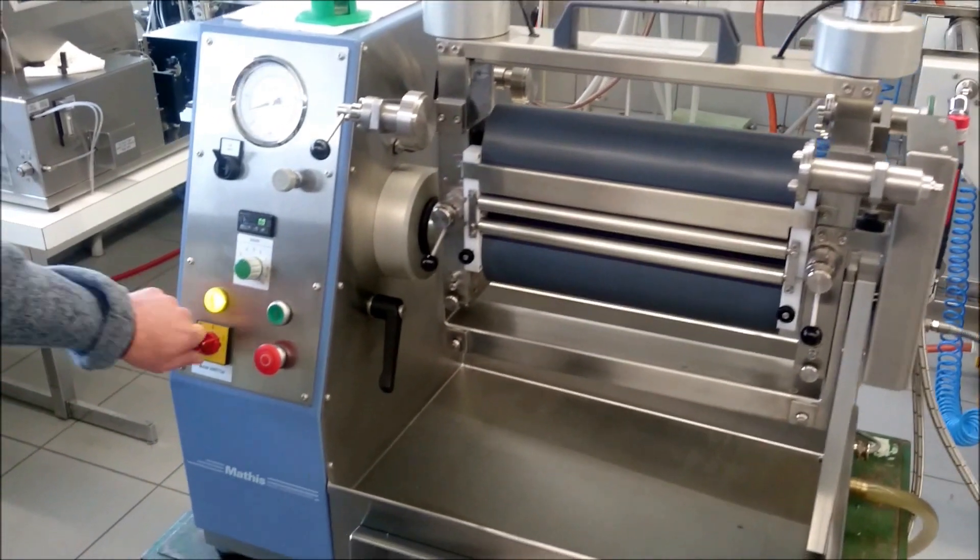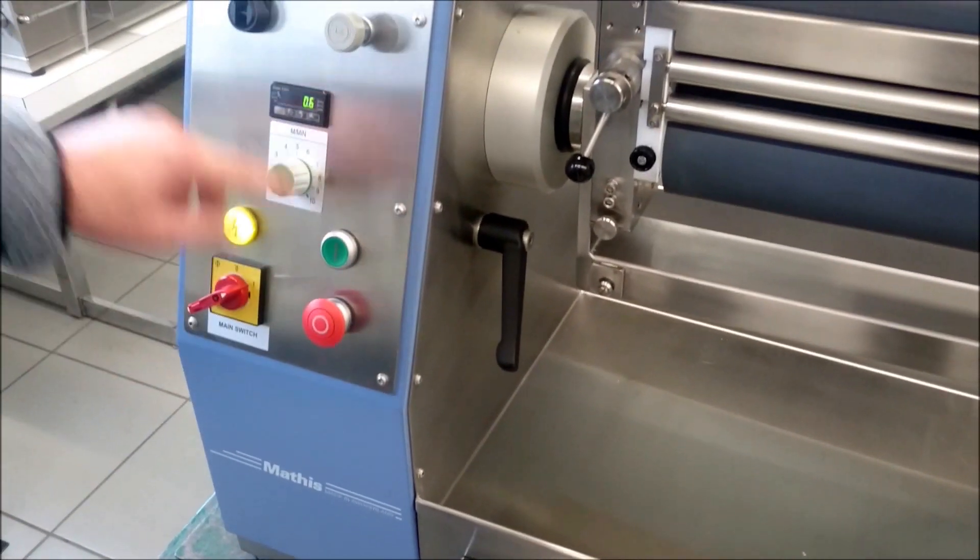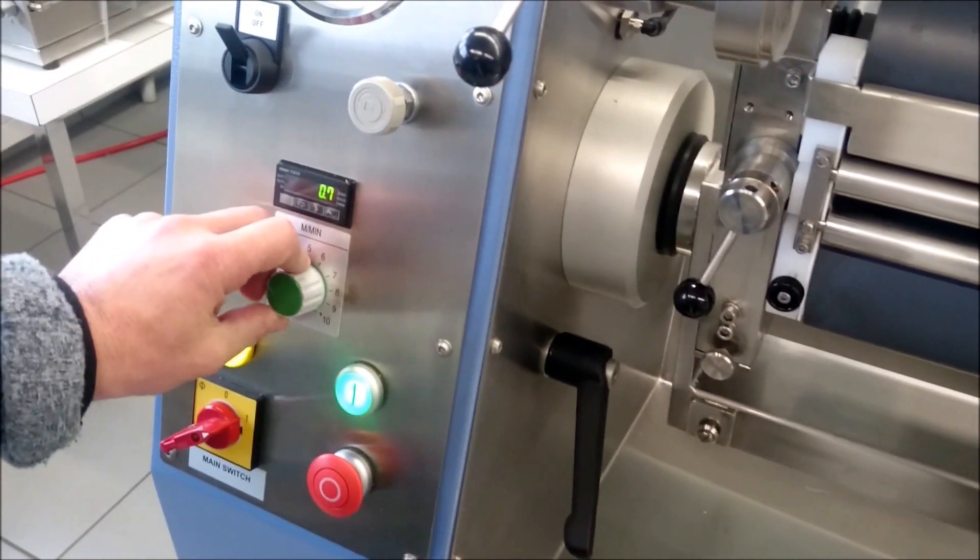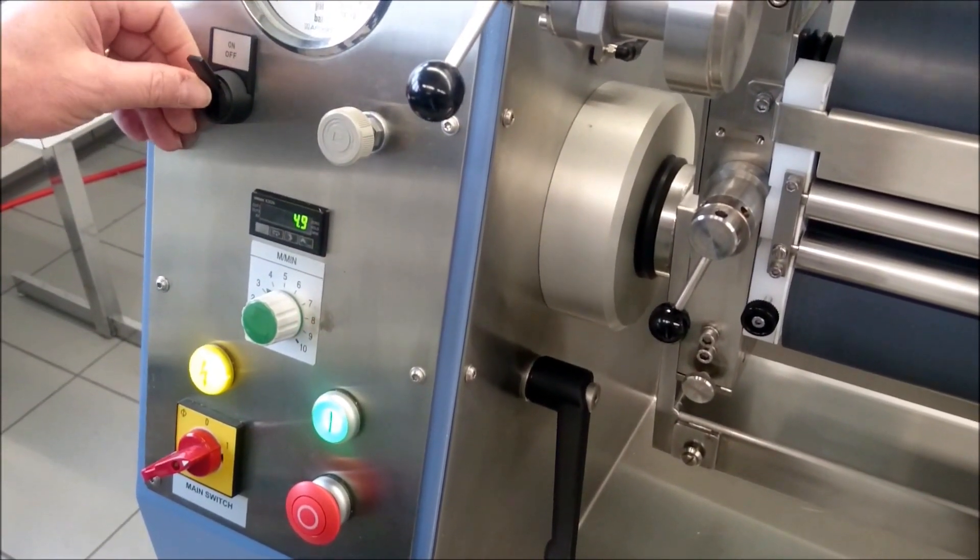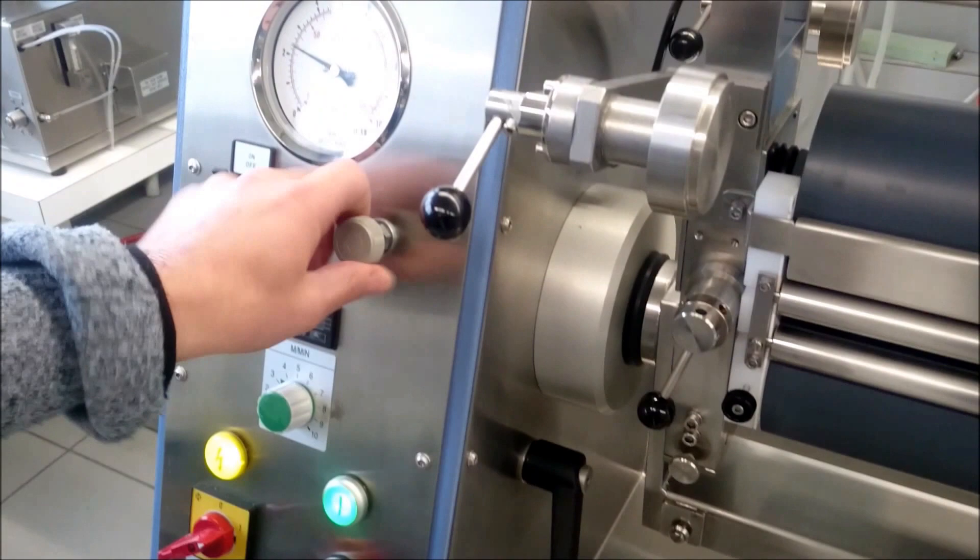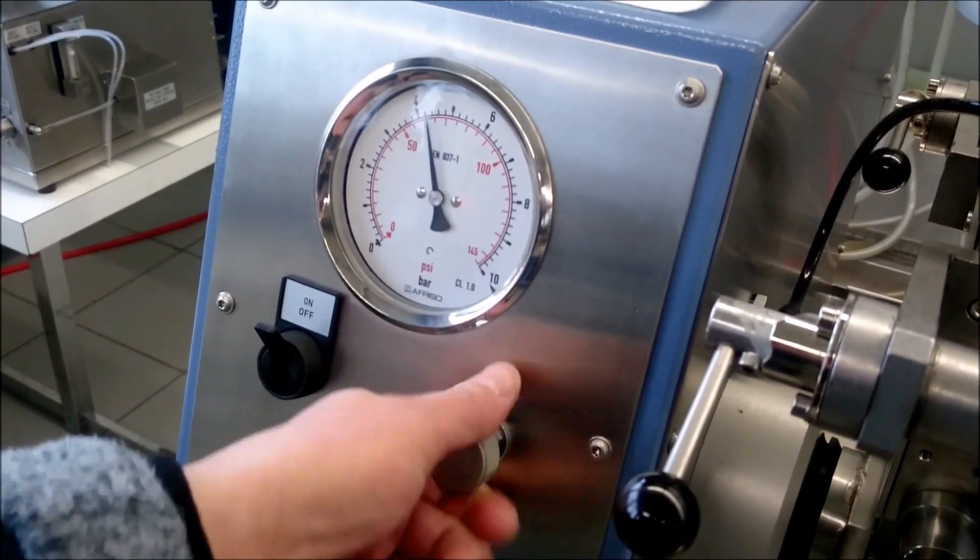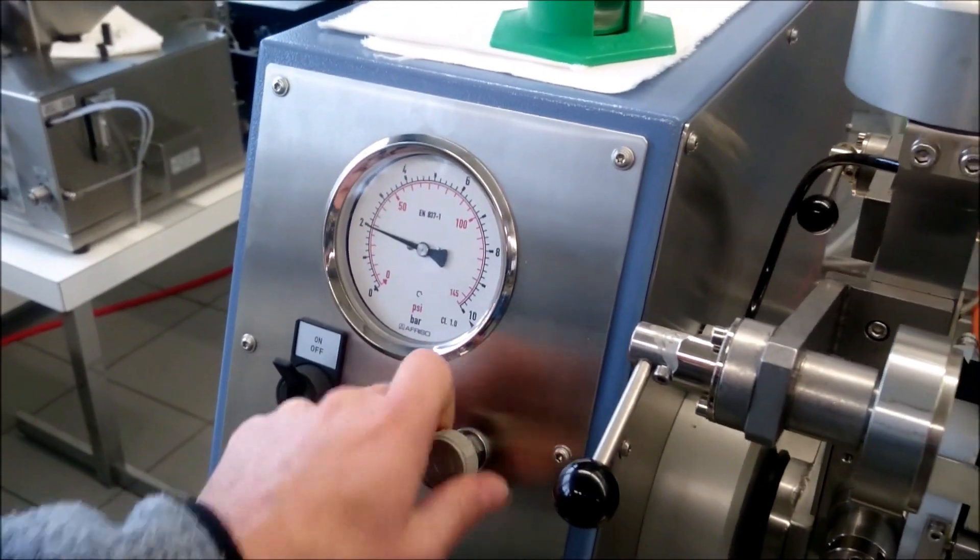What we have here: main switch, then we have start and stop. Speed is from 0.1 until 10 meters maximum. Opposite here, switch off squeezing with the adjustments from 1 bar until maximum 6 bars to adjust the pick-up of the samples.